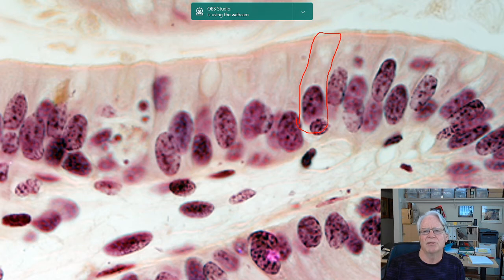This nuclei belongs to a different cell. There's my oval shape. Again, you see, we can draw a line across here. We've got all this space between here and here, and this would be the bottom, or the basal surface, of the cell. Again, we get the fuzzy edge. That's the microvilli. And this structure right here, that's a goblet cell.